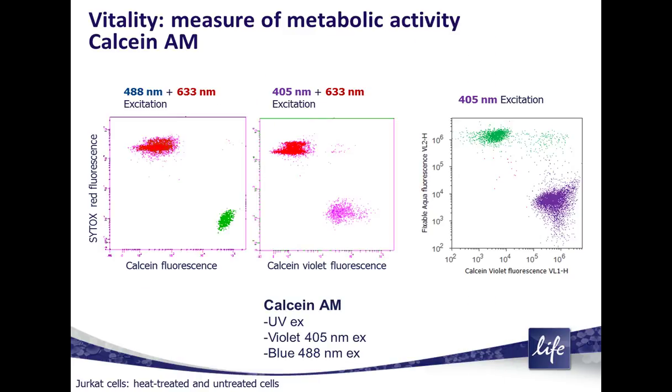So cell vitality, as measured by intracellular esterase activity, is a recognized parameter of cell health. Live cells are distinguished by the presence of ubiquitous intracellular esterase activity. The acetoxymethyl, or AM, ester derivatives of fluorescent indicators make up one of the most useful groups of compounds in the study of live cells.